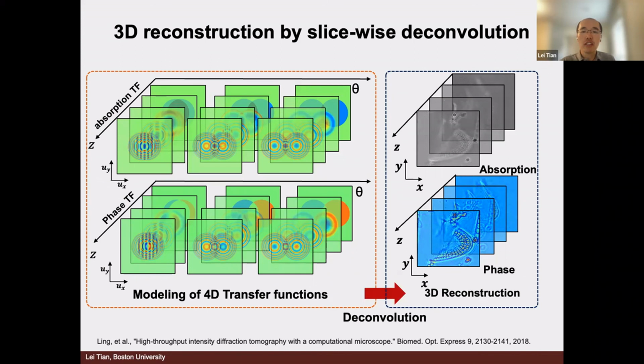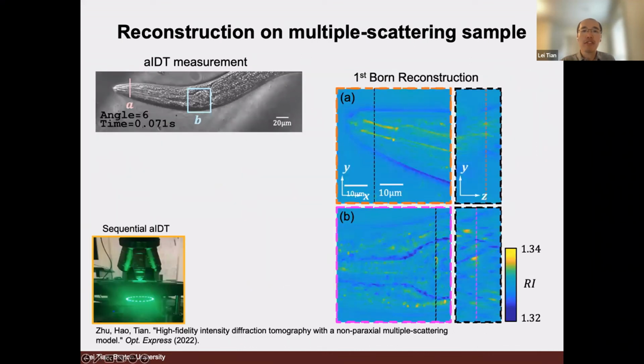And also the other thing you mentioned about resolution versus complexity, let me clarify that. The first model we use is very simple. I highly recommend using that for initial prototyping. Our general observation is that for small scale samples, it always works. It's just that when it comes to samples like C. elegans, the structure becomes more complicated. Some of the small features might get lost.